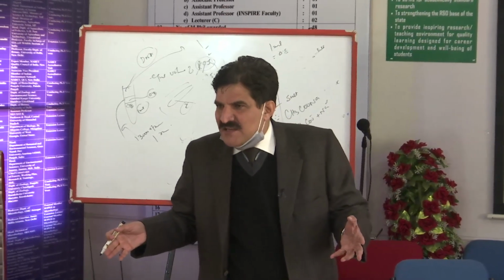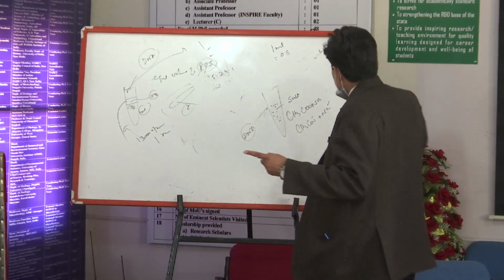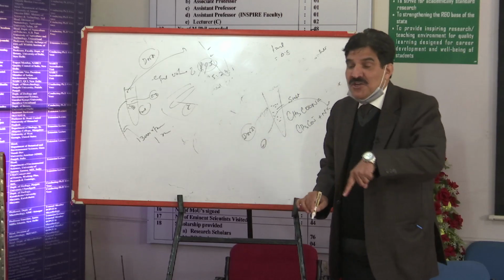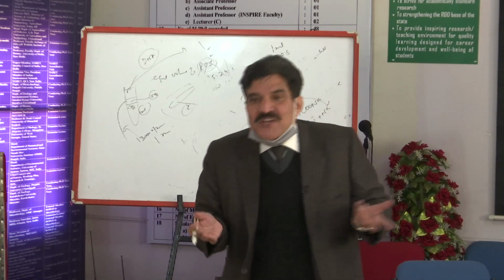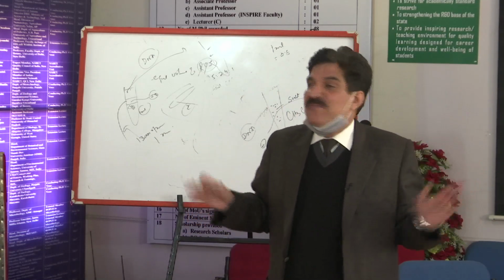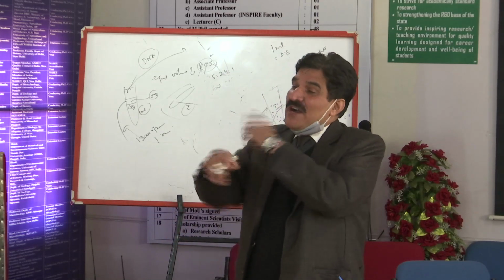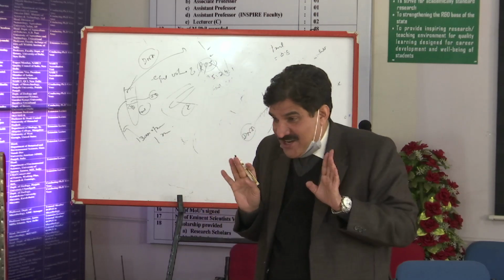Precipitation is less, so we will not achieve good precipitation. Now this sodium is covering the negative charge, neutralizing it, shielding the charge. So it is charge shielding; it is charge-less, we can say, though not completely chargeless.